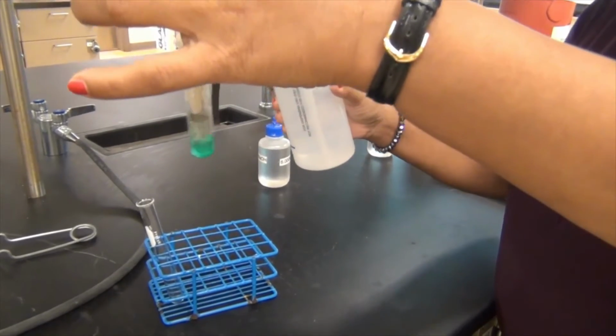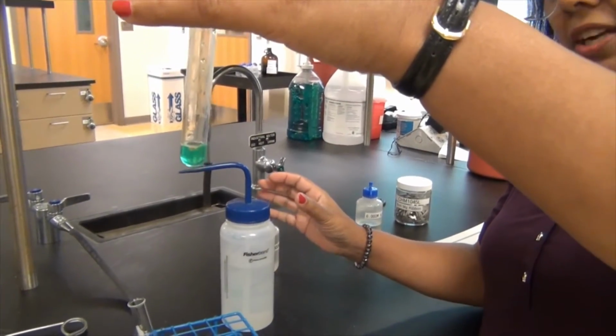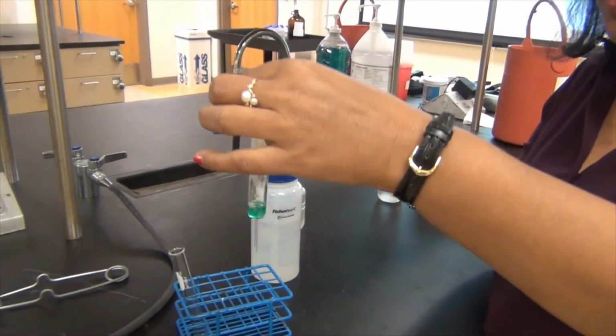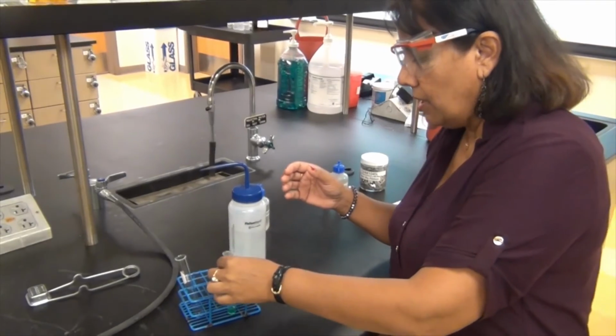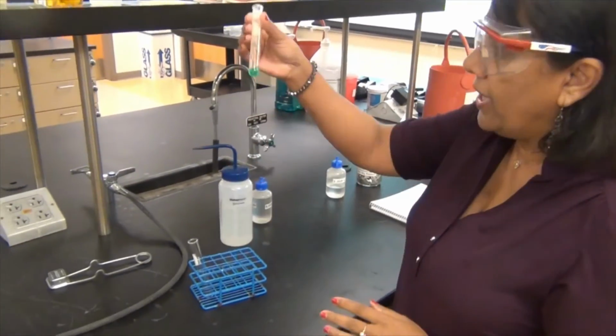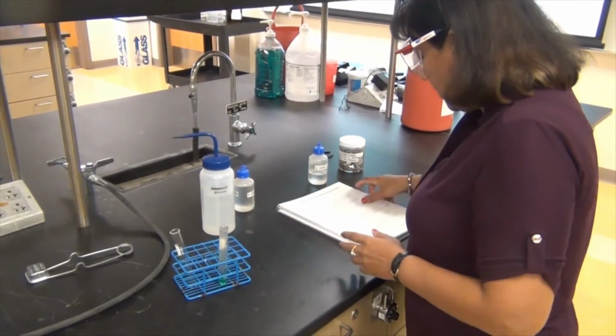Okay, so that's adding a little bit of water. Nice pretty colors, okay? So I want you to write the colors nicely. Don't give me aqua, okay? I have no idea what aqua is. So give me blue, light blue, green, light green, dark green, whatever it is, or red if you're seeing red, but don't give me aqua or something, okay? Because I don't know what that is.